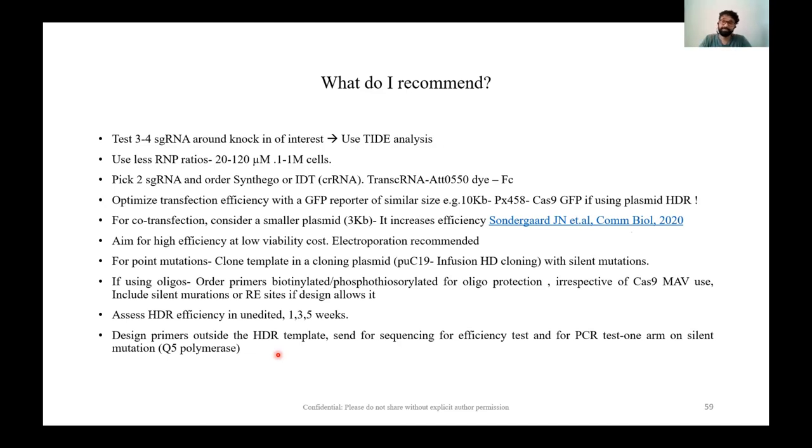Just send it for normal Sanger sequencing and use, again, a few tools to assess your HDR efficiency before you spend more time characterizing if the HDR actually took place, or even keeping your cells in culture for 1 month.